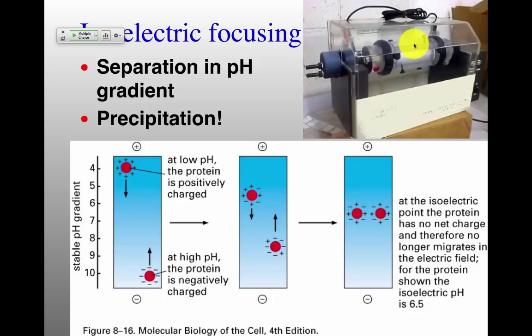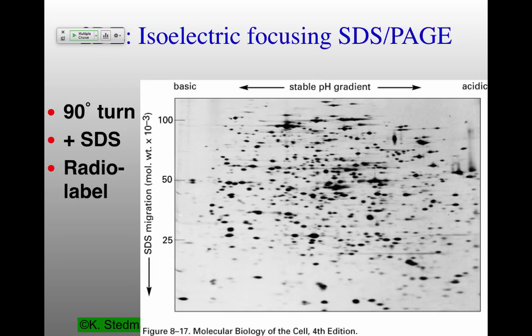And in theory, again, it's a really, really wonderful technique. But in practice, it turns out to be, at least for preparative purposes, which is what this box is supposed to be for, not terribly useful. It does turn out to be useful, however, for, great lead-in, thank you, two-dimensional gel electrophoresis.